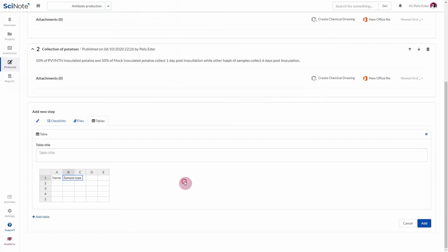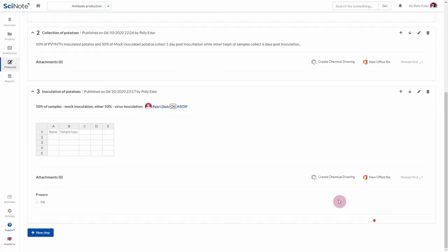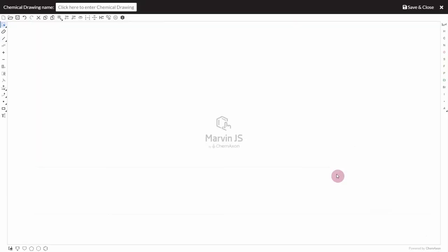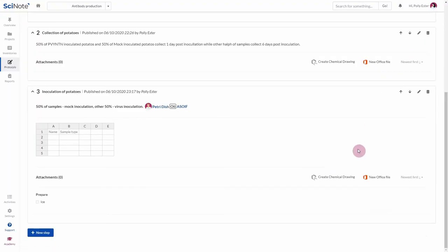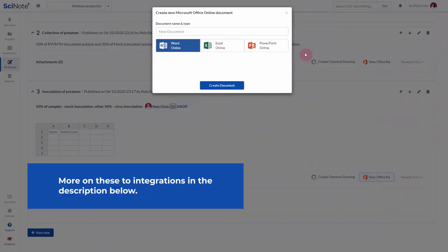When you're done editing a step, click Add. In addition, you can also create a chemical drawing with the MarvinJS integration and a new Office file with the Microsoft Office integration.